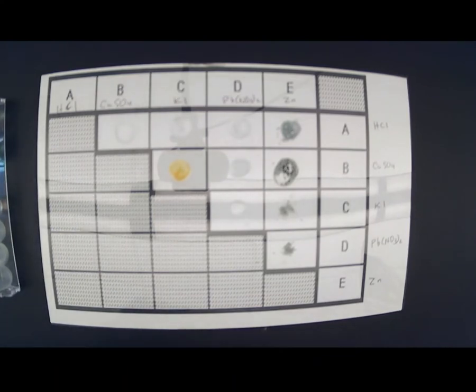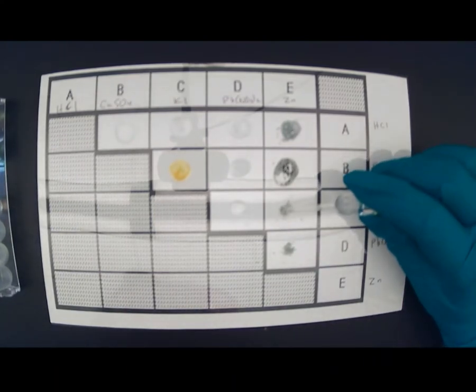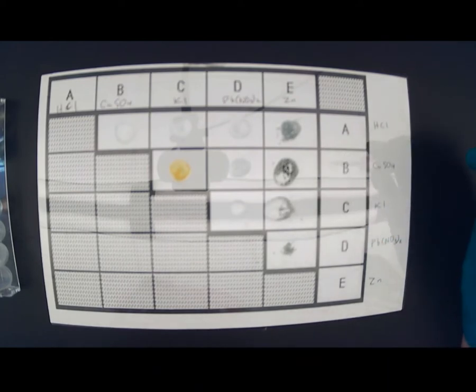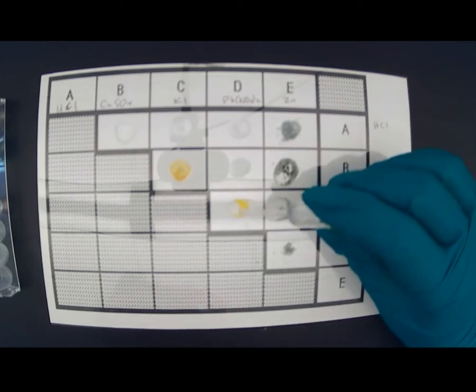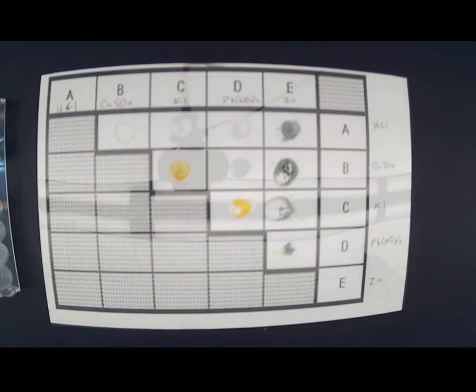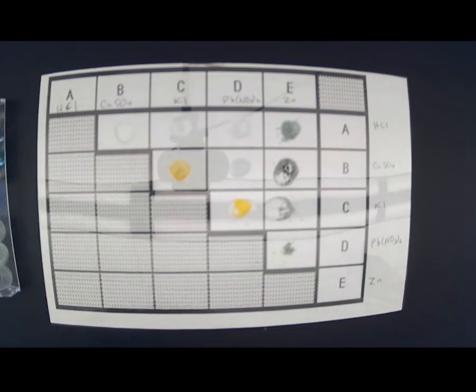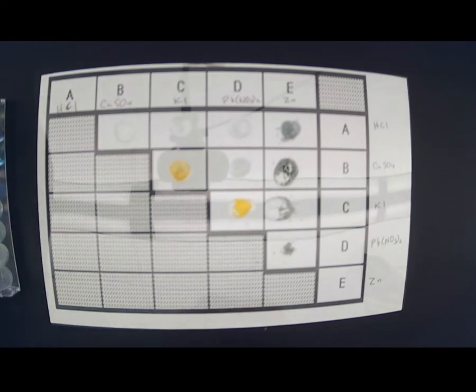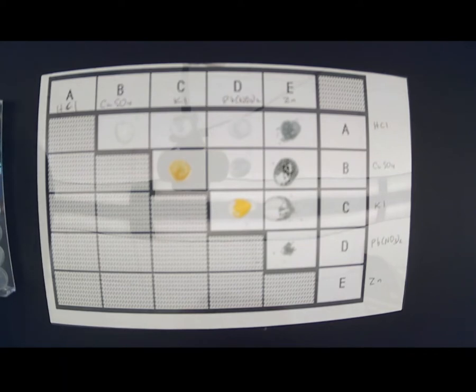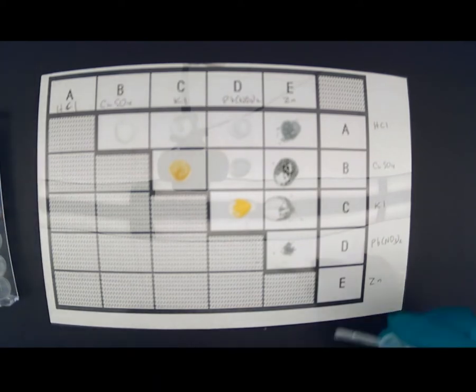Next is potassium iodide — I'm going to put a drop in each one. Potassium iodide there, and potassium iodide there. Hopefully those don't end up touching because I don't want them to mix. And the last one is lead nitrate — there is the lead nitrate, which is the pink one.